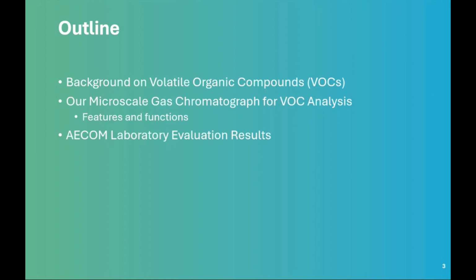Now, I'm assuming that most of you have found your way here because you're uniquely interested in volatile organic compounds, but I'll start off the presentation with just a little bit of background information on VOCs for those who might not be so familiar. Then I'll share a little bit of background information about our microscale gas chromatograph, but I have recorded an overview webinar on this topic before, so I'll direct you back to that if you want some more information about the VOC analyzer.